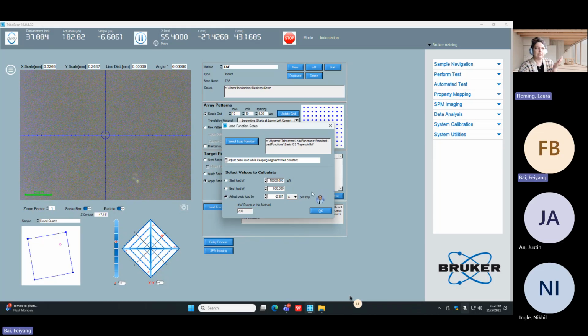Yeah, sorry, right, then it doesn't matter. So that's reason one. The second reason, which I think is a more compelling reason, has to do with drift. If you think about that automation, there's only really one big move, right? Going from optical view to tip and contact.